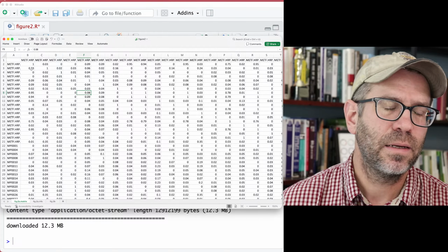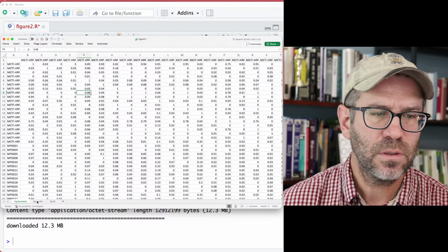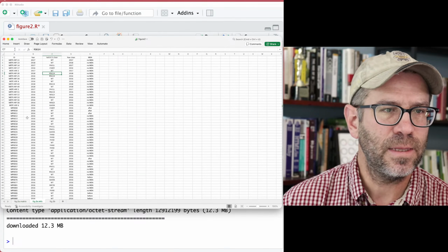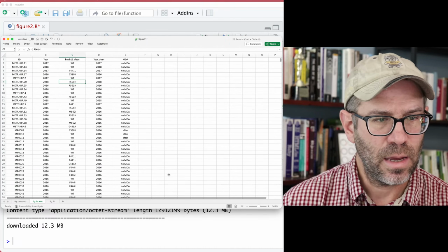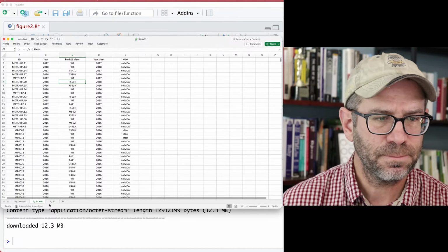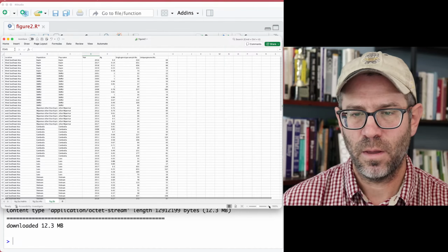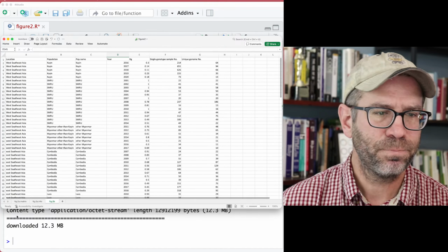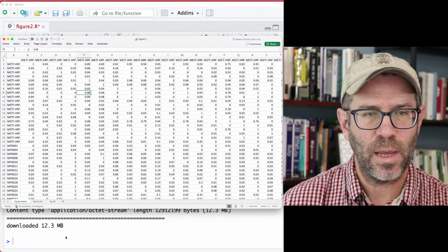And then those are those values. These are relatedness values, whereas these are the data for figure2A, the info, right? So these are what's across the top in those bands. And then figure2B are the data at the very bottom of the plot in panel B, right? So for now, we're gonna focus on figure2A info and figure2A matrix, okay?